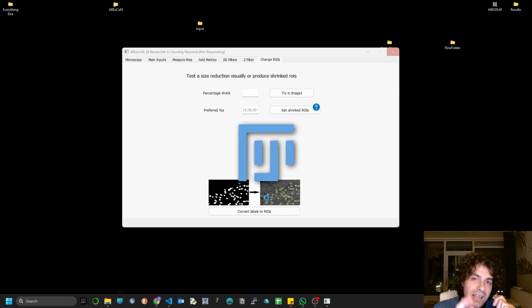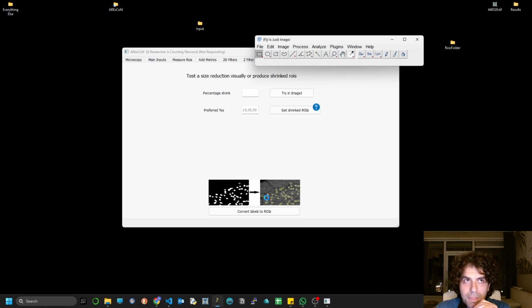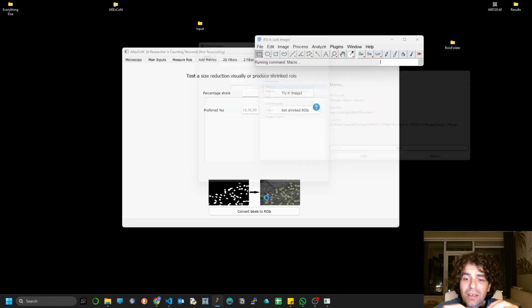There is a slight difference between the rows that you get, and this is actually something that in particular circumstances can be important.